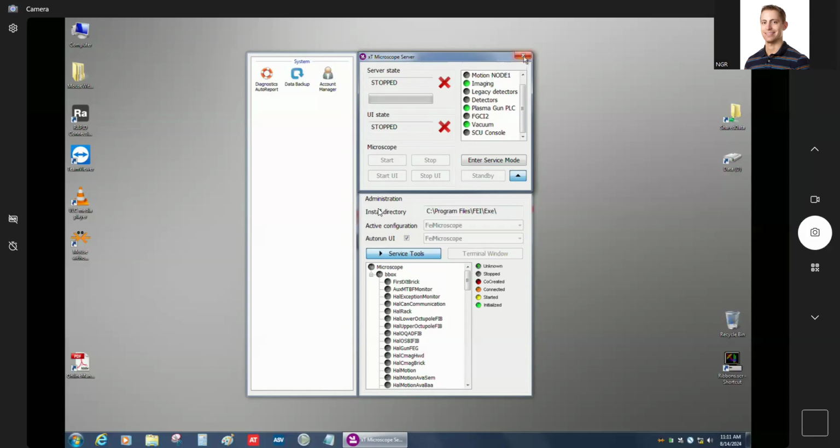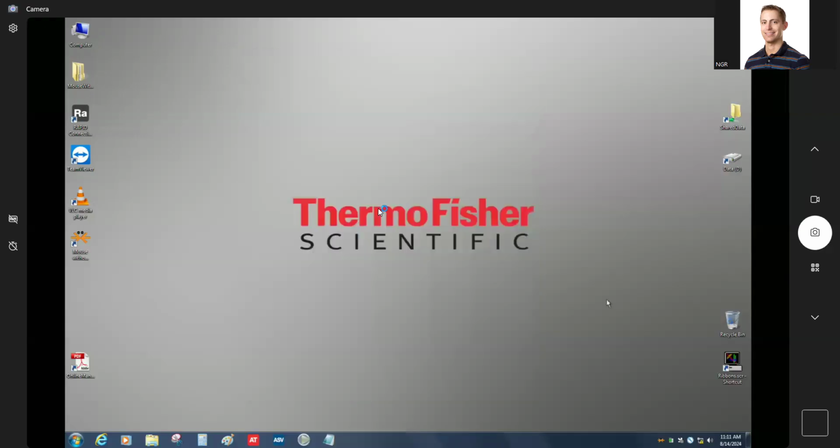All right. We'll go ahead and continue. I'm going to go ahead and just close this. Now we need to actually stop the server. So if you right click in the system tray, exit server. Yes, do you want to exit? You do. Okay, and so now we're going to shut down the PC.